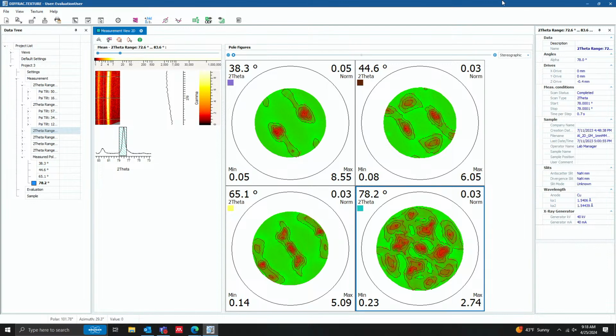Why do they all look different? Because we're looking at different directions along the crystal axis. So it's a combination of process and crystal symmetry that we're seeing here. And that's why we don't necessarily have to take the full pole figure. Right. For each one, you can use them to reassemble everything that's going on. Exactly. It's almost like if this was a globe, you have satellites pointing in different directions.